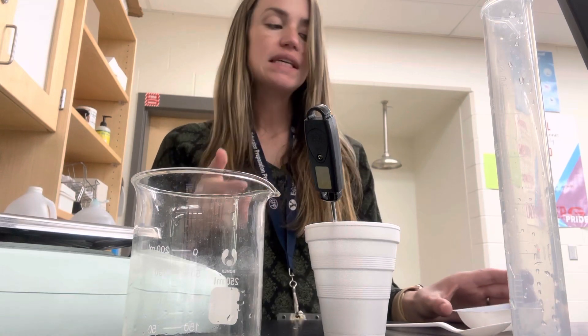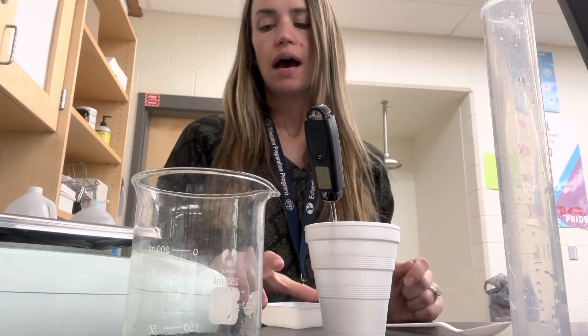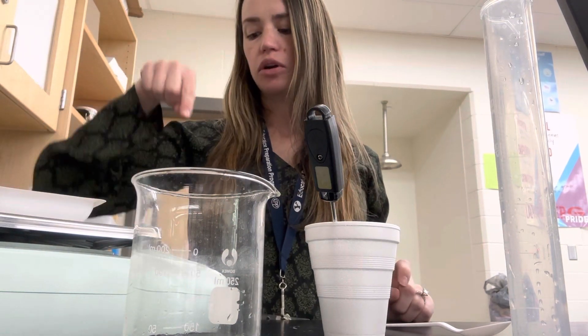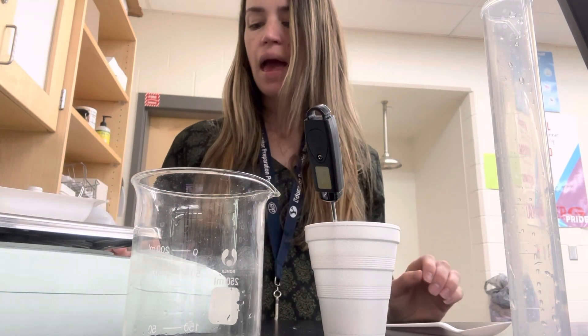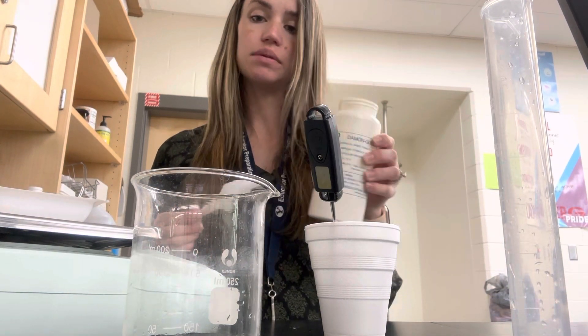While the thermometer is sitting in there, get the mass of your solute — the thing you're going to dissolve. Get one of the little weighboats, put it on the scale, and remember to push the zero button so it doesn't take the weight of the weighboat. Then for each trial, you're going to use about one gram of your substance.